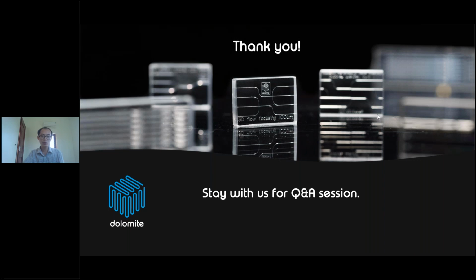Another question from Rakesh: is it possible to integrate your system with other systems like zeta potential or particle size measurement process or other systems? Actually, the zeta potential or particle size measurement system is a kind of post analysis system. So there's no problem to connect, to integrate our system with this system.